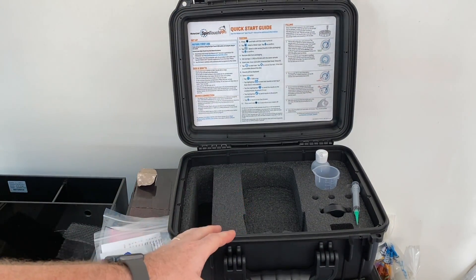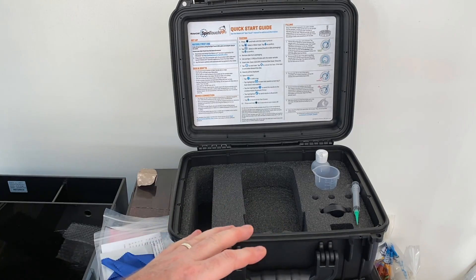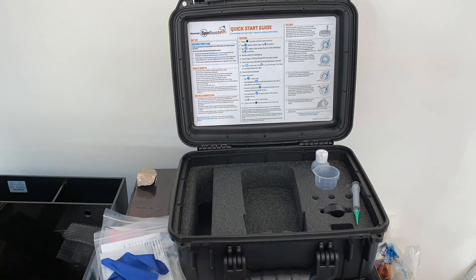Here at Deer Park Aquarium the device is going to stay on the shop counter and get plenty of use. It's going to save staff so much time for customers wanting their water tested. They can bring a sample in, load it up, spin it, and it'll give a result to let you know whether you need to dig any further on any parameters or if everything looks within the ballpark.